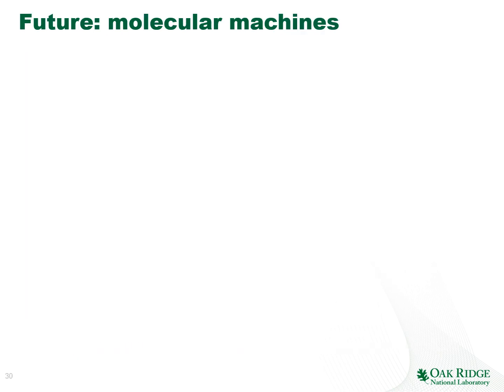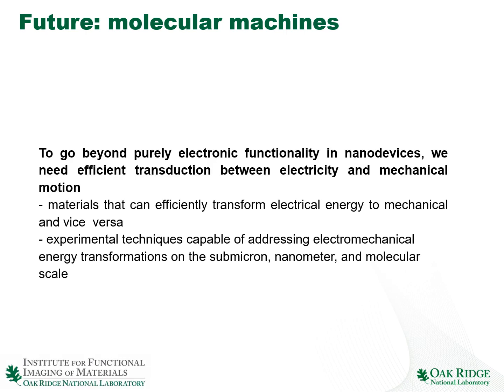So, just to wrap up this introductory lecture, let me speculate a little bit about the future. Where would PFM be in 5 to 10 years from now? One of the opportunities going forward is to go beyond the purely electronic properties in nano devices.